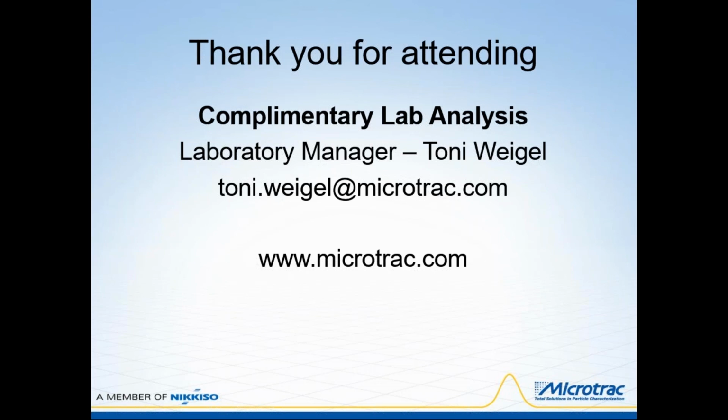Okay, Terry, is the customer able to specify the recording time? You can set up the instrument to measure for a certain number of minutes, user selectable, or you can set it up to start a measurement when it first sees particles tumbling through the sensing zone, and then you can set up area limits to end the analysis. In other words, when the sample flow becomes so low that you're only seeing maybe one particle every few seconds, it can end the analysis at that point. So you have a couple of different ways to set the timing.